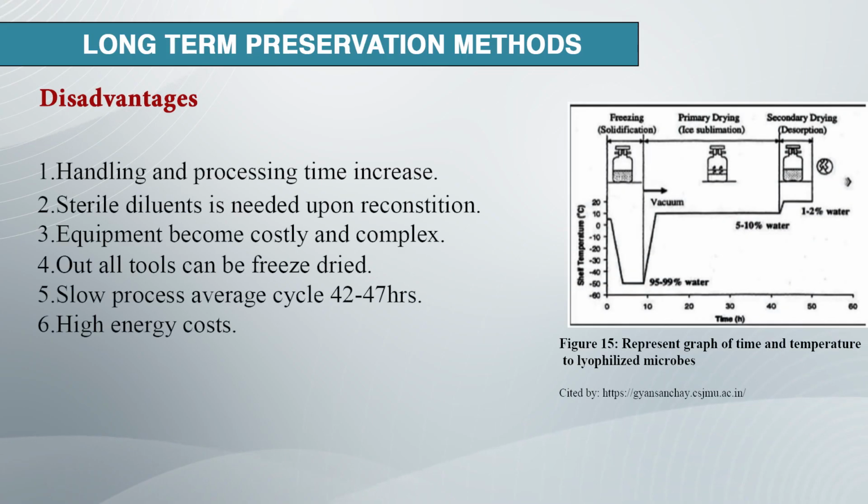Advantage: only minimal space is required and hundreds of lyophilized cultures can be stored in a small area. Sterility can be maintained for a long period of time. This is the graph by which we can see the time and temperature of the lyophilized microbes. Now, disadvantages: handling and processing time increase.